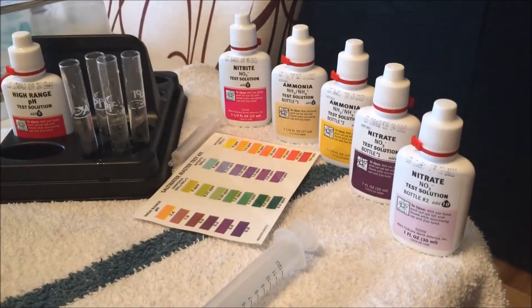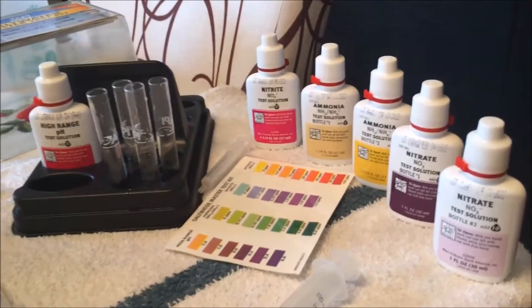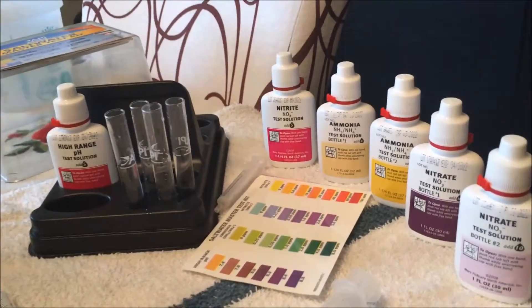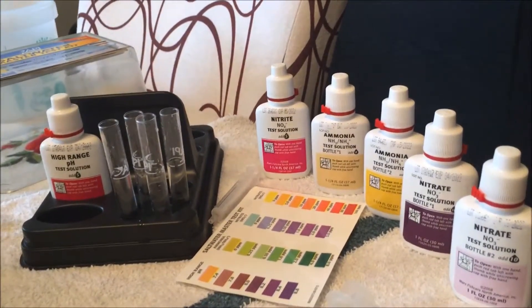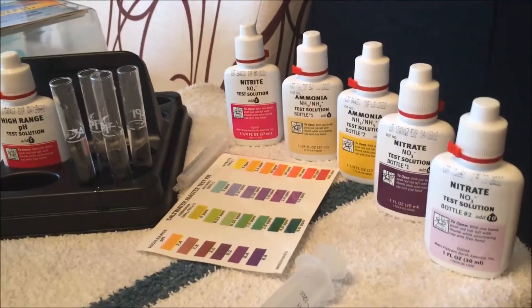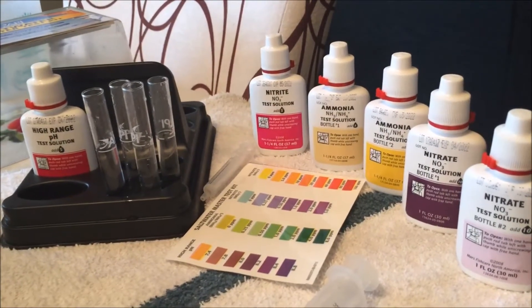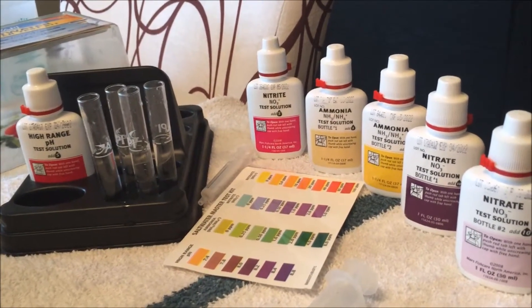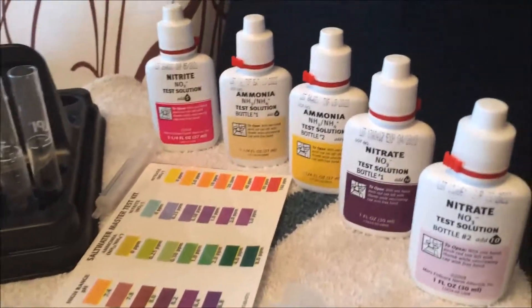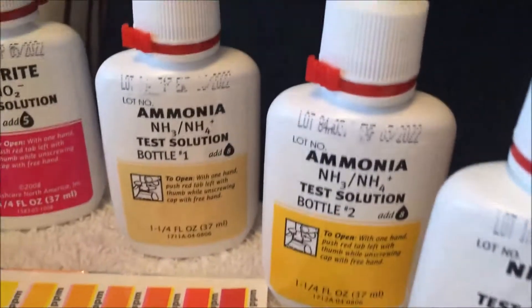Hey, what's up reefers - this is Exclusive Reef. I responded back to one of Marine Depot's videos on API tests versus Salifert tests and how they are completely off. I was called out to show it or it didn't happen, so here's what I'm going to show. I have your basic saltwater master test kit over here, and everything expires in 2022.